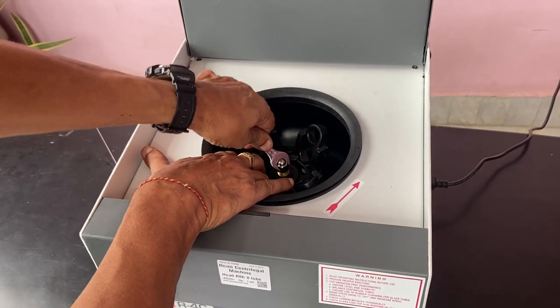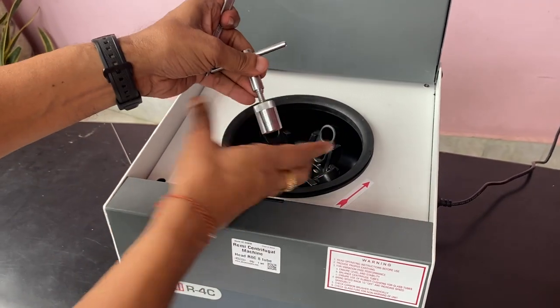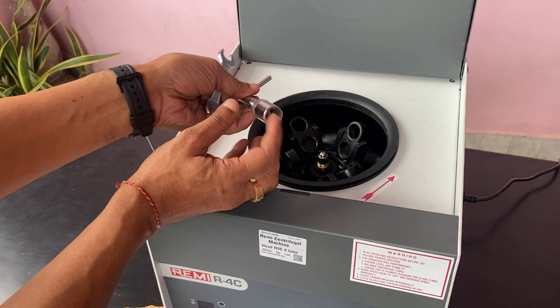It should be completely tight. If you want to change the head, there are another two tools provided. You put it here and open the screw.